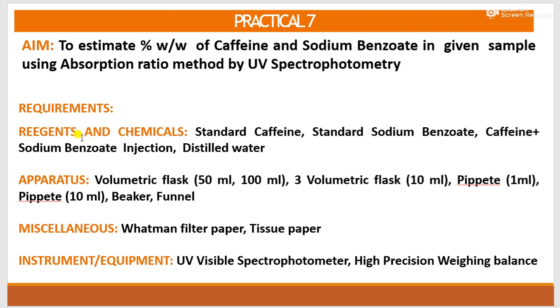Requirements: reagents and chemicals required are standard caffeine, standard sodium benzoate, caffeine sodium benzoate injection, and distilled water. Apparatus: volumetric flask of different sizes 10 ml, 50 ml, 100 ml, pipettes, beaker, funnel. Miscellaneous requirements are Whatman filter paper and tissue paper. You require UV visible spectrophotometer for carrying out analysis and high precision weighing balance for weighing purpose.